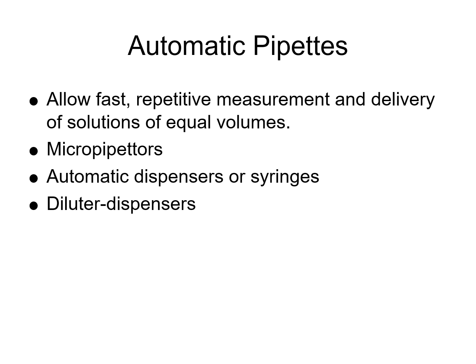Ensure devices are calibrated regularly to maintain accuracy for all these types of pipettes we talked about. You're going to want to use the appropriate tips, syringes, or dispensers to avoid contamination. And once again, we're going to follow those manufacturer or CLSI guidelines for maintenance and operation.